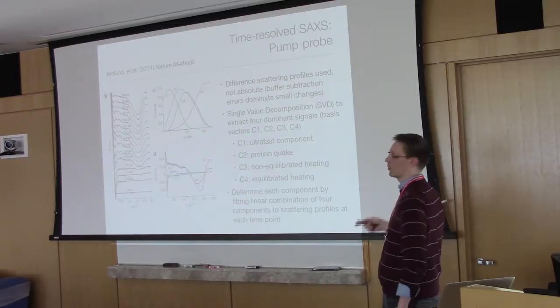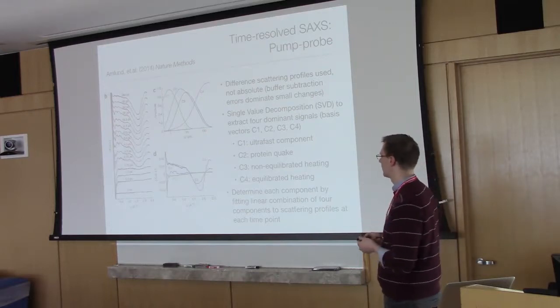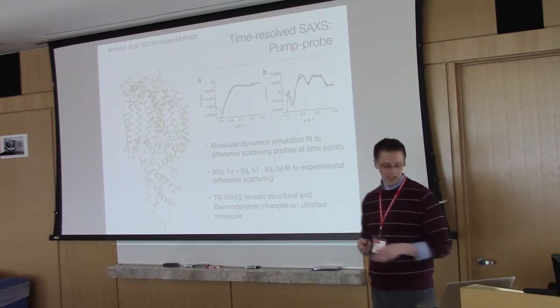And they notice things like a protein quake. The protein is actually quaking with energy as it absorbs light, amongst other things. And I think this is just a little video of that flexing that they were able to do, some modeling to fit that. And I think that's it.